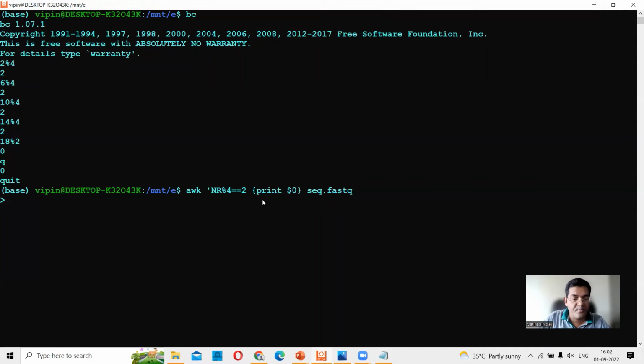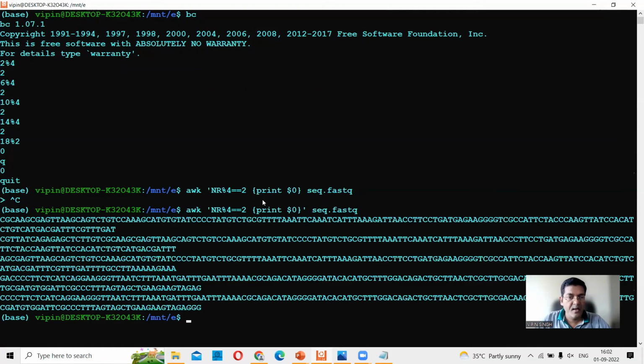We forgot to put the apostrophe. So let me just Control-C here, and we put the apostrophe. So that is, the syntax has to be satisfied. So here you are, and you press enter. And here are your sequences alone, right? So you have only the sequences and nothing else.